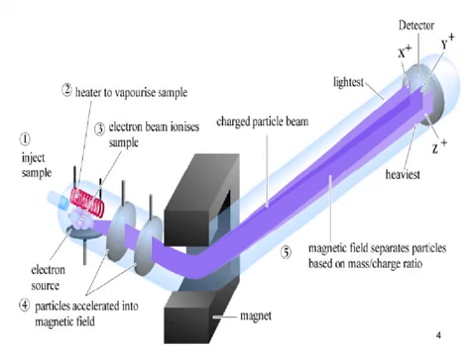Here, I'm going to show you three different pictures of different mass spectrometers. All will be based on separating positive ions on the basis of their mass and charge. Let's take a quick look at this one, and as I've said, we'll be looking at three separate diagrams, and we should get a little bit out of each.